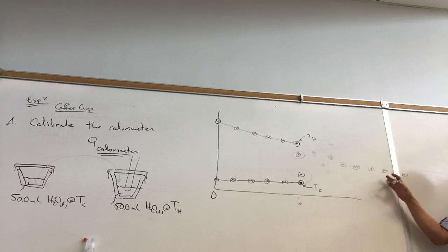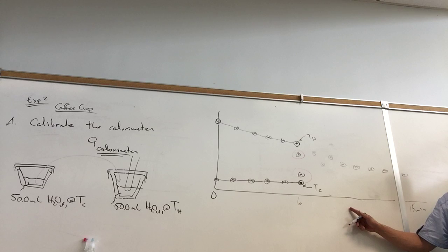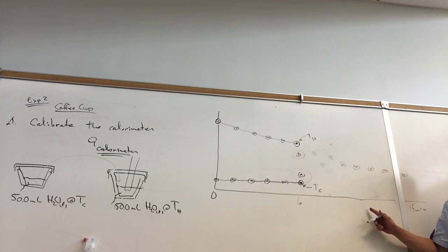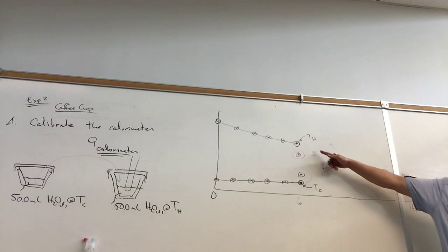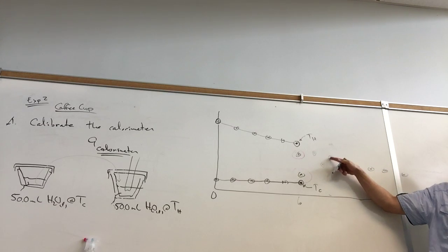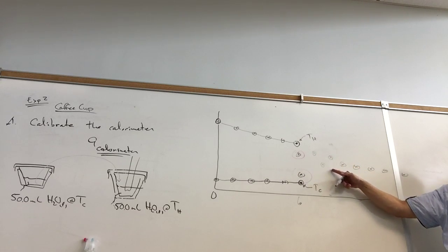In order to see the steady cooling trend, what I want you to do is the second deviation from the procedure. What we're going to do is we're going to collect 15 minutes worth of data. The procedure says to collect, I think, 12 minutes worth of data. But 12 minutes might not be enough. And so we collect about 15 minutes so that all of this incomplete mixing, we can get past that.